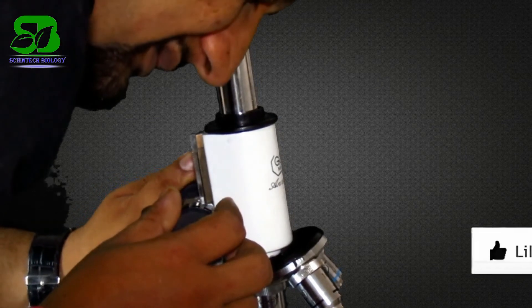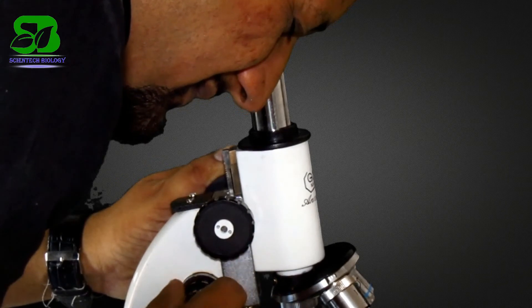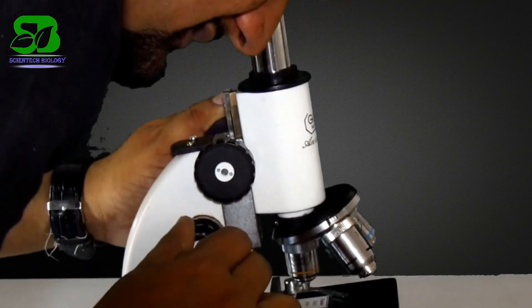Now look through the eyepiece again and turn the coarse adjustment for focusing. You can also use the fine focusing adjustment for better results.